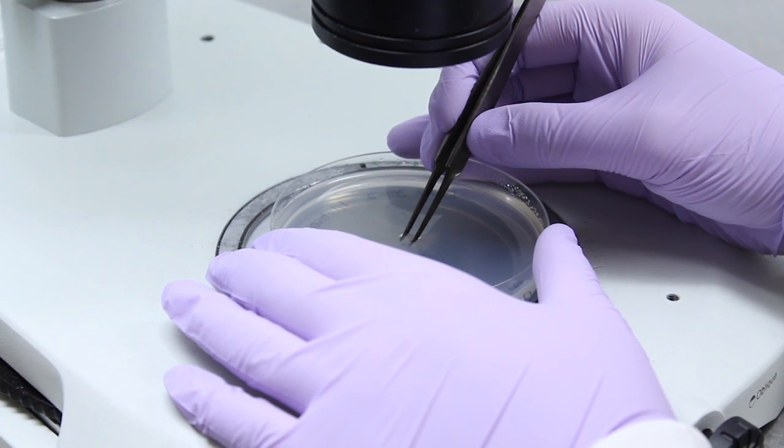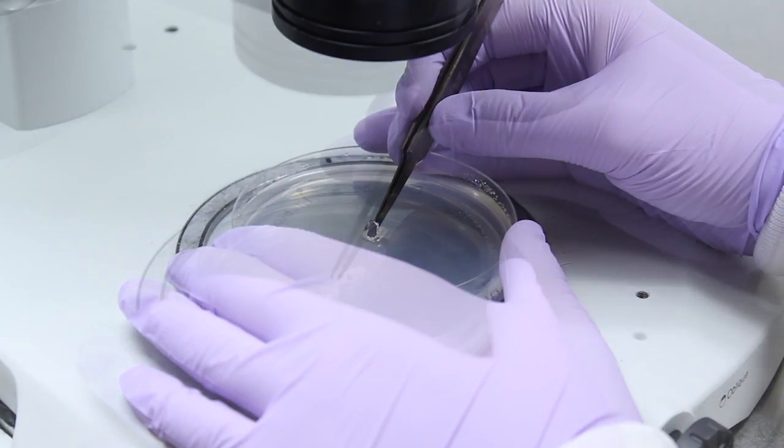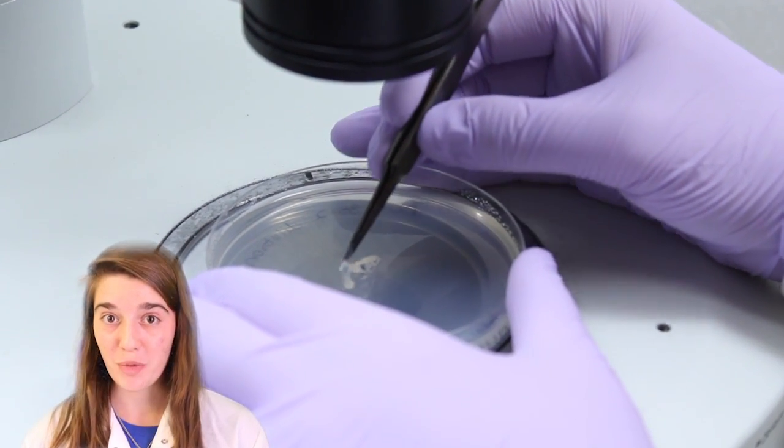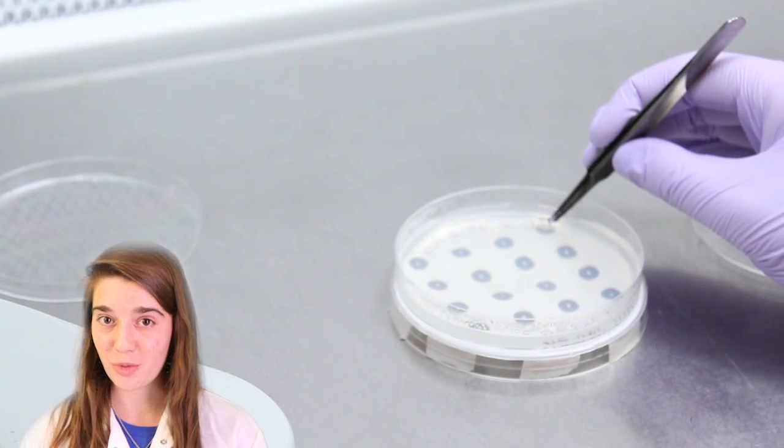Place your dilution plate under the microscope and pick one single germinated spore onto one of the 16 spots. It is very important that you pick up only one germinated spore. We only want a single individual in each of these spots.